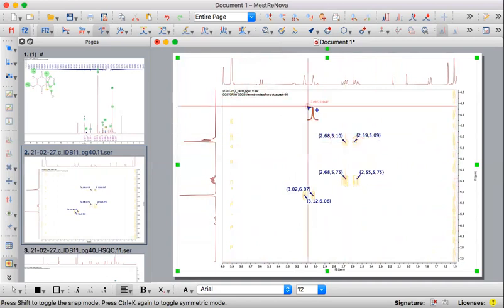There we go. We're just picking all the resonances. And if you look closely, it does lock on to multiple positions. If you want to be super accurate, you could pick every single position that it locks in on, but really just a single position in there, just to show you where those correlations are, is all that is necessary.